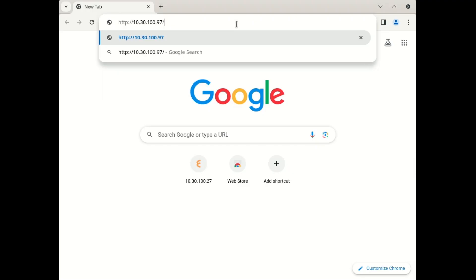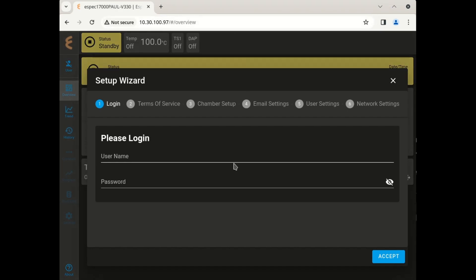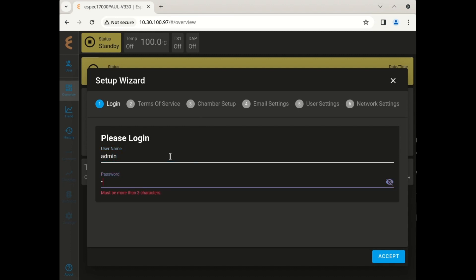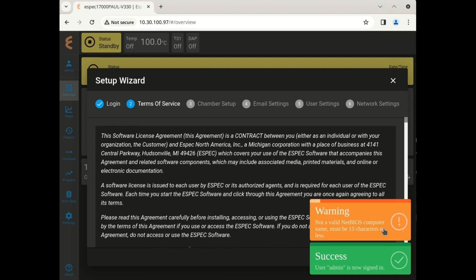Now that you have the web controller access info, open a browser window on your computer and type in either the IP address or the host name and hit enter. This will start the setup wizard. The default username and password is 'admin.' Later in the wizard, you will be prompted to change this default password, which is recommended. After entering the username and password, hit submit to continue through the wizard.